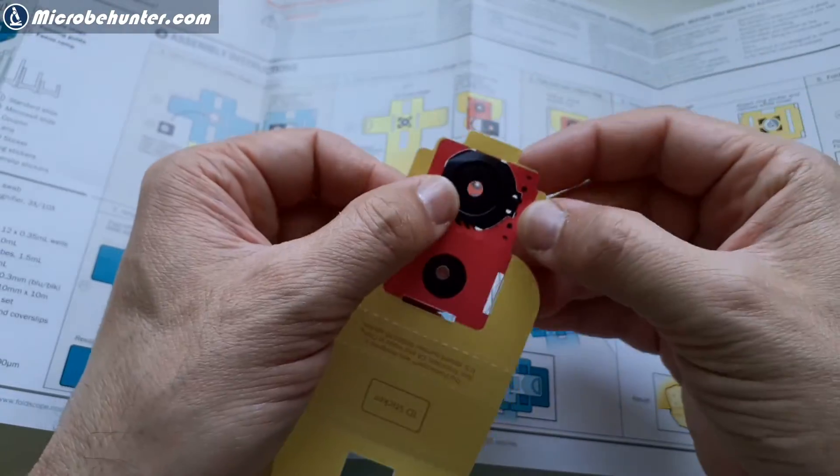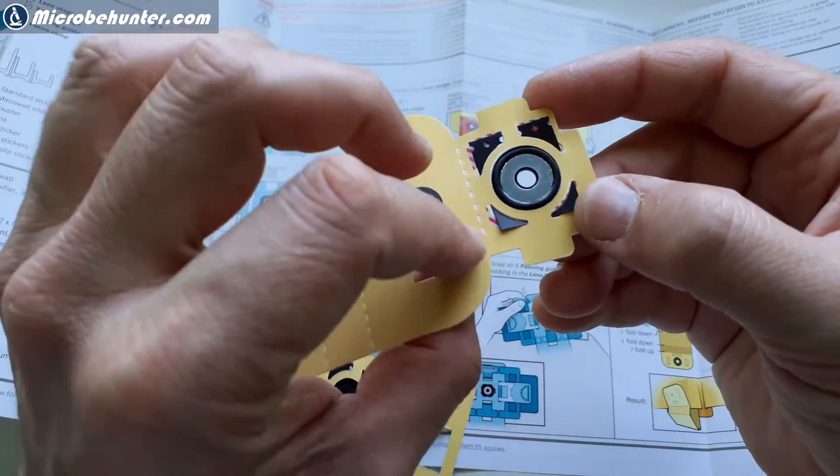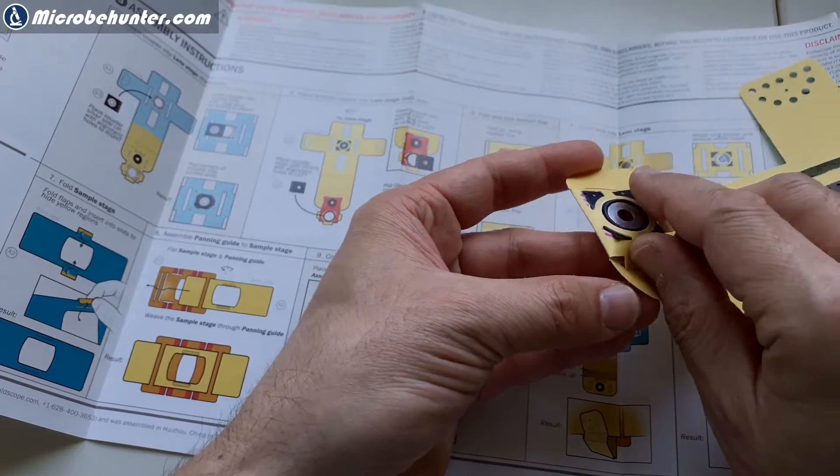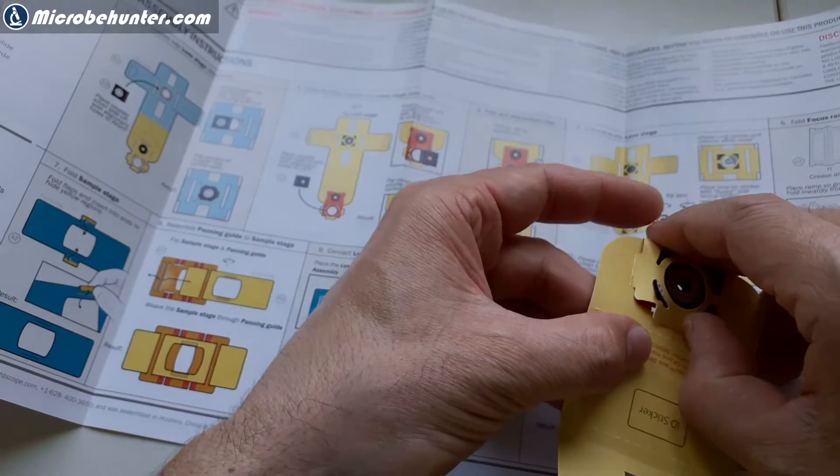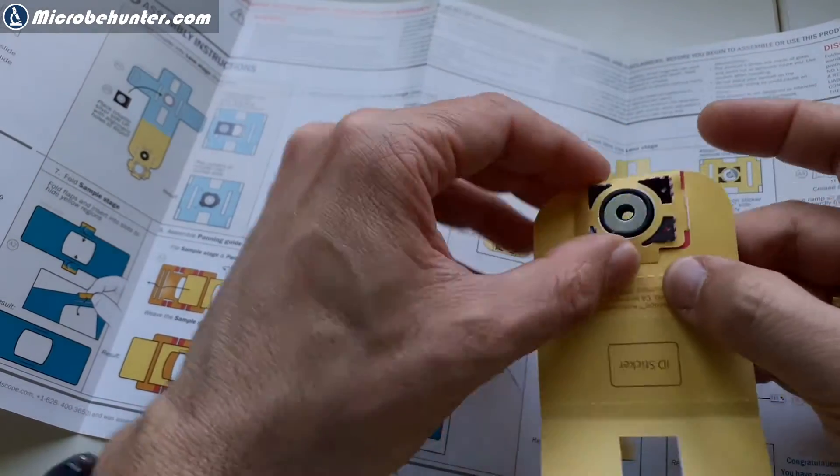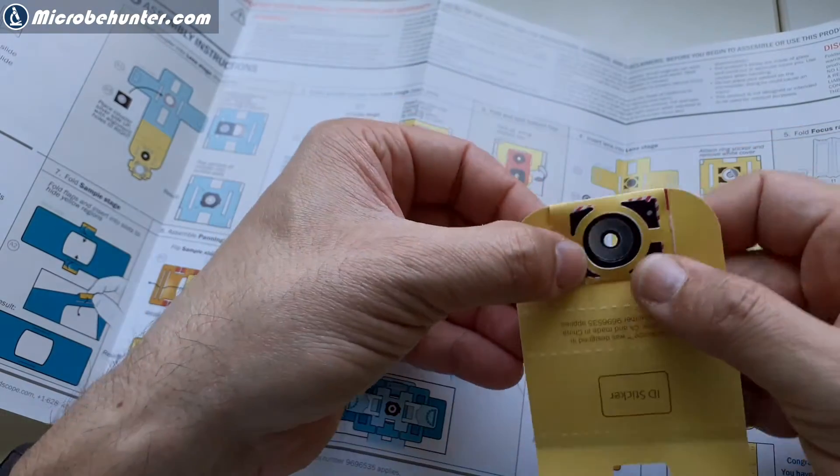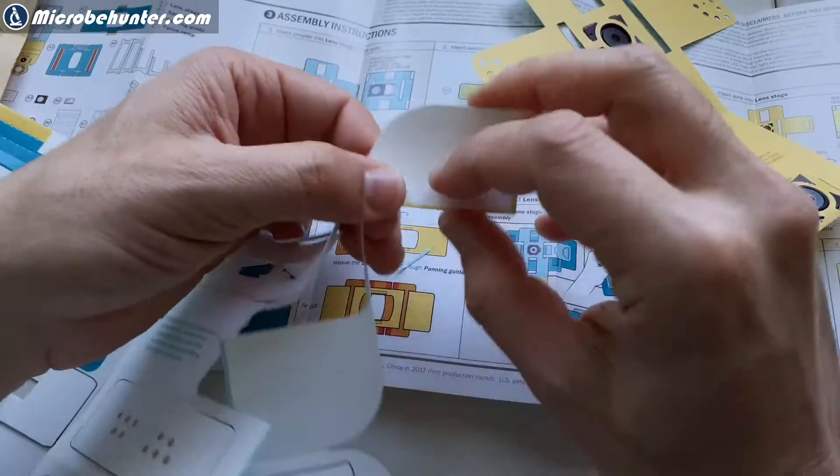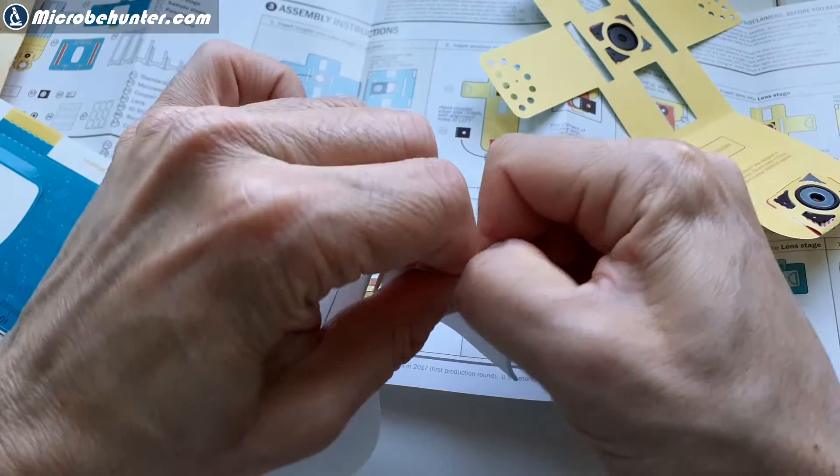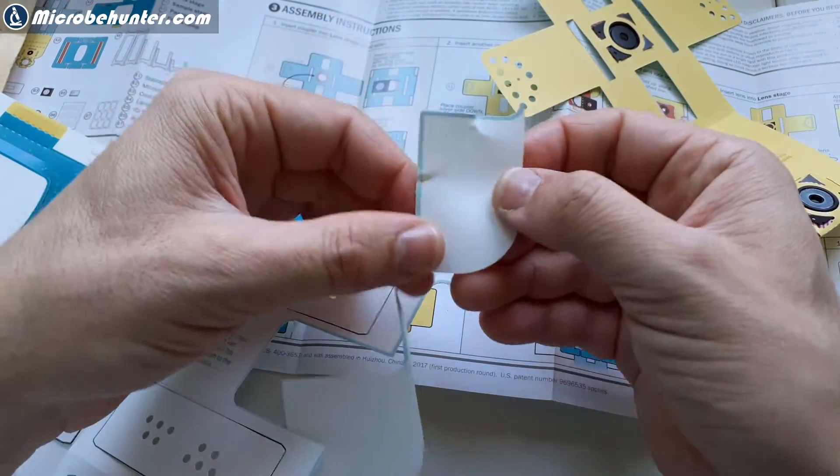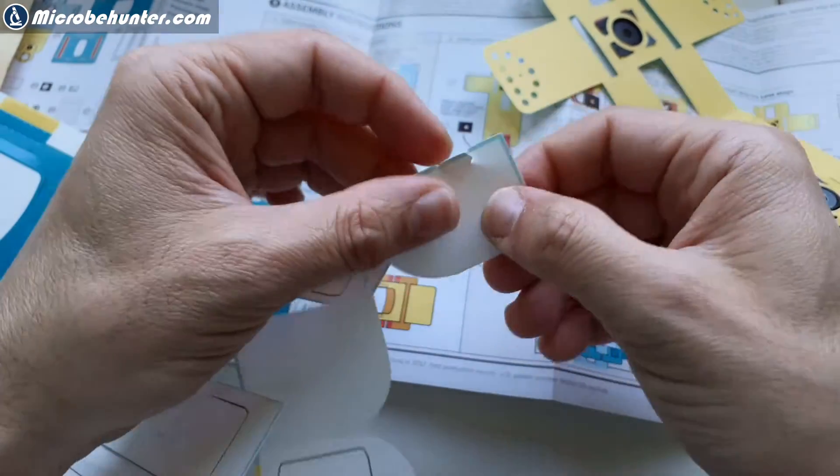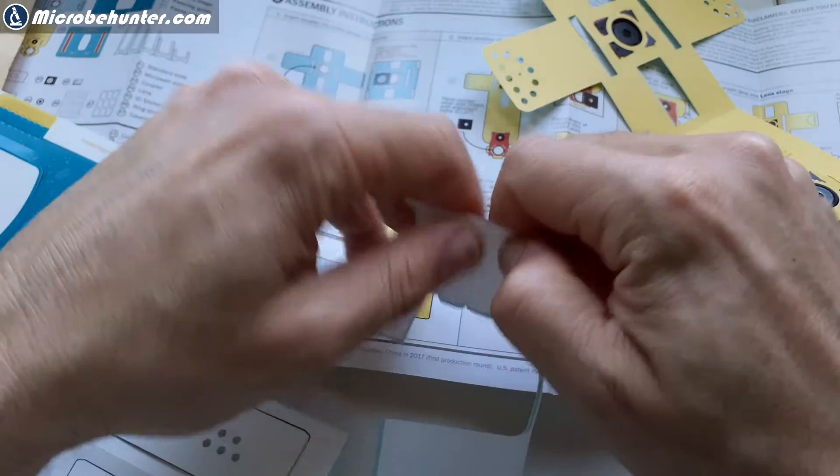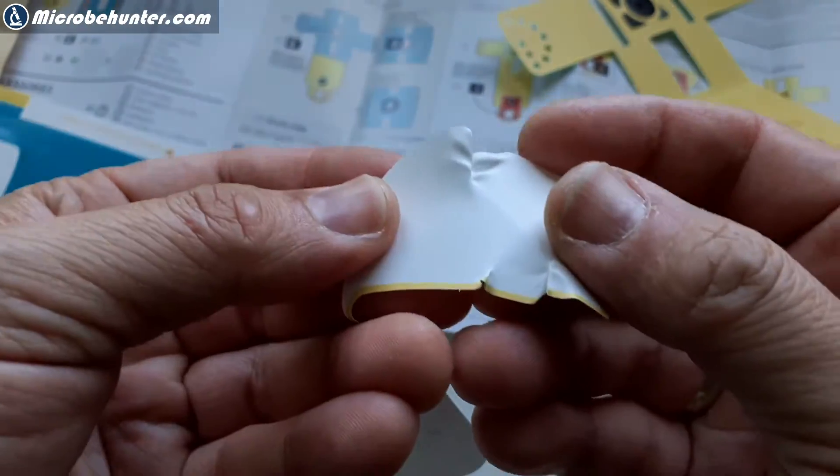So this basically I'm just going through right now. This is basically where I had to insert one of these couplers. Everything held together without glue. If glue was necessary, well, these were double-sided stickers and that's basically one place where I needed them. But otherwise everything could be put together quite easily. So I think it's a pretty good project also for clubs and for children, for education, for schools. Not only because it's a microscope which allows you to observe the environment, but also because the kids kind of learn how to follow instructions and a nice hour-long project and then kids can go out and collect some samples. And the first big surprise that this paper microscope actually is not made of paper. I tried to tear it and I couldn't tear it. This is actually plastic. This was really something that I was positively surprised by. I was not able to rip it. It was that strong because it's plastic. So it's also waterproof. This is something that I kind of like as well and significantly more durable. So concerning the quality, honestly, it's nothing I can really say. I'm quite happy about that.